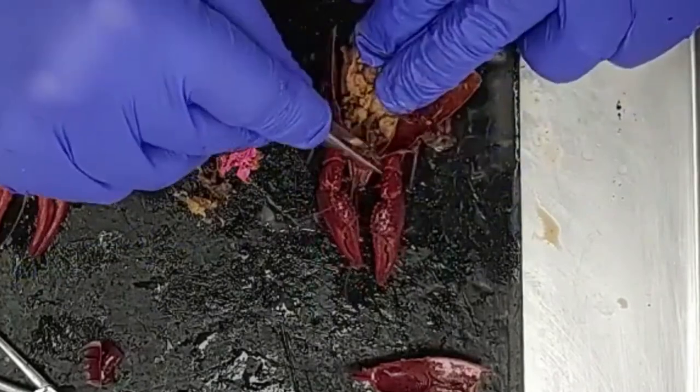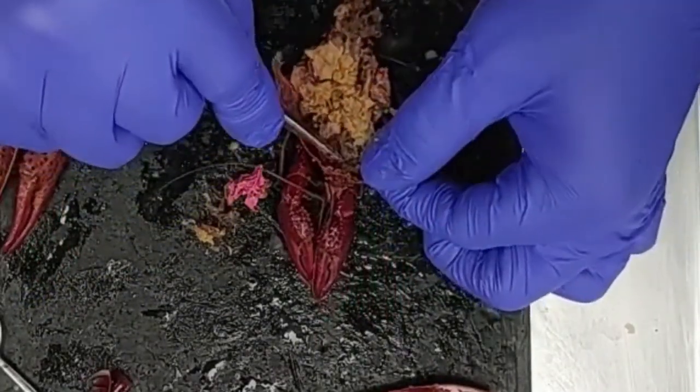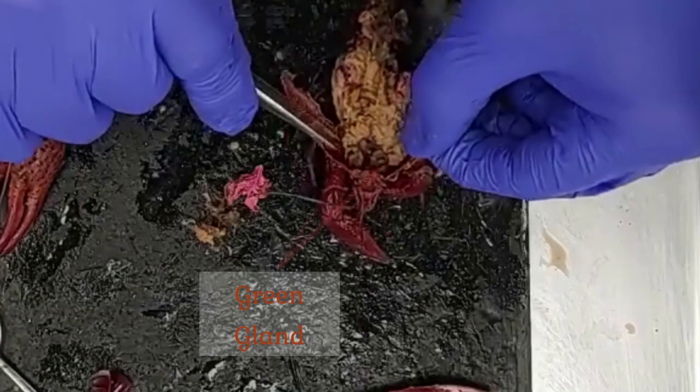We can also look at a couple more structures up at the anterior end. If we take out the stomachs and look in the head region, we see two big prominent glands known as green glands. Those green glands are the excretory structures of the crayfish, and they have ducts that open out at the base of the antennae.